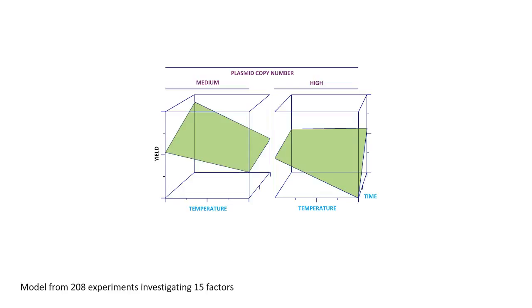These design cliffs, these sensitivities to parts of the environment or parts of genetic space are all over the place in biology and are one of the major drivers of why you'll have a laboratory practice that works one week and not the next.